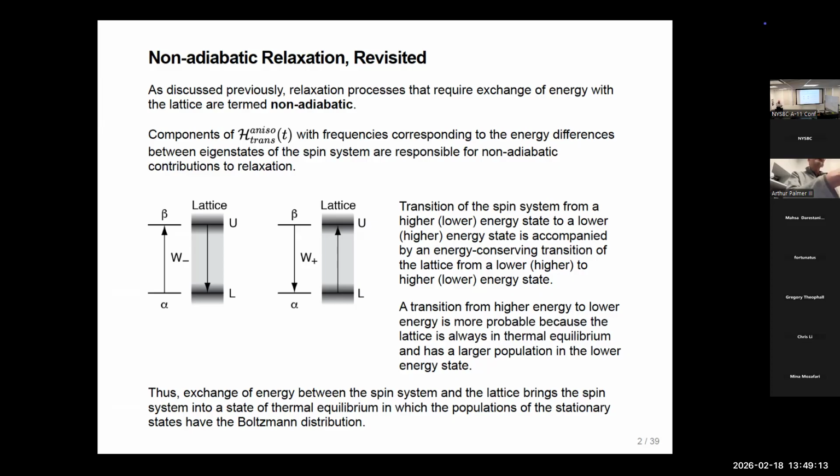But we're working on dimensions much smaller than the wavelength of the radio frequency field. At 500 megahertz, if you sit down and do the calculation, the wavelength is, I don't know, a few centimeters. So the dimensions we care about of the sample are much less than the wavelength, which would be called near field.